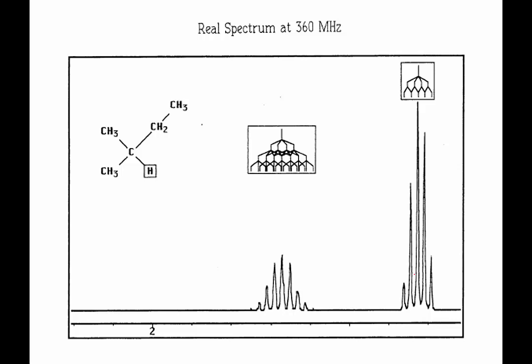No school ever purchases just for their own use. They always have a consortium. But that's why we want to use big magnets, because we want to do biomolecules or polymers, plastics and other things. We want to spread these peaks out.